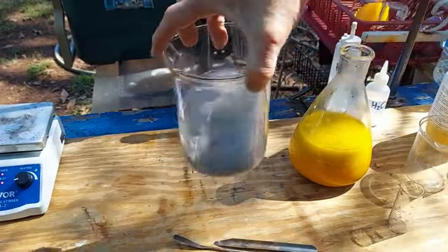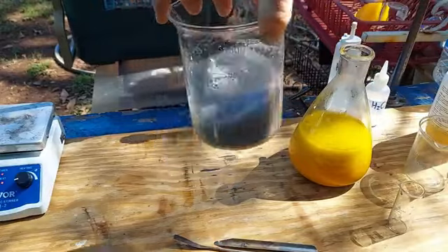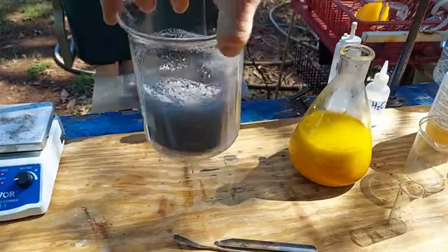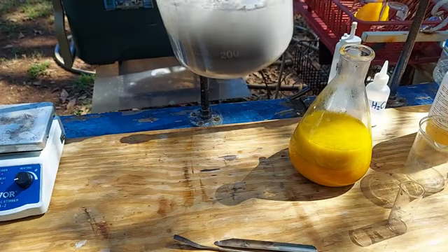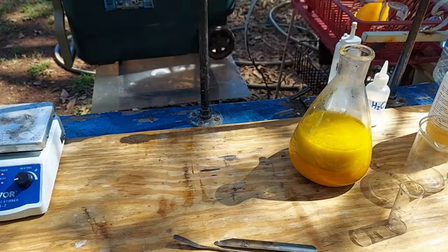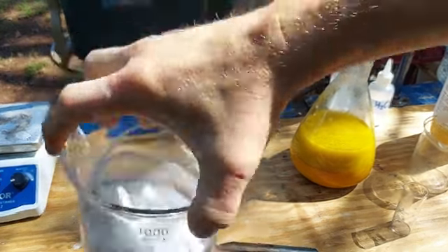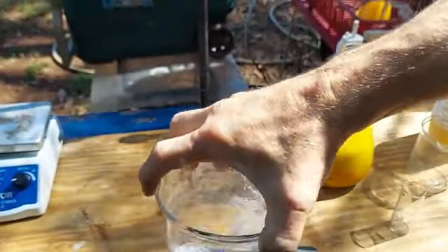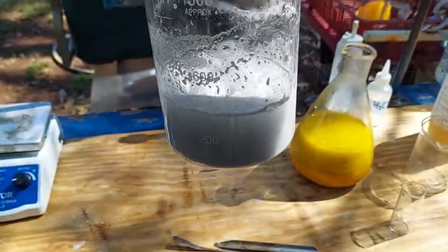I'm just wondering, if we add some mercury to this, will that stuff start to absorb into it? Exactly what happens here? What does happen here? Interesting. Well, the clumps of mercury disappear and it looks like we have more of this powder.